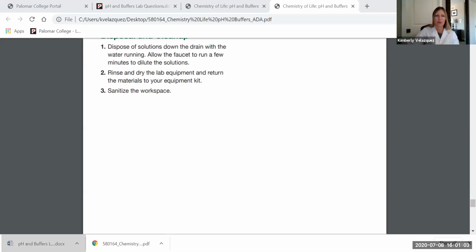Okay, activity 2, completing the data table, answering the question, and then inserting your picture. And finally, activity 3, you need a drinking straw for this activity. You're going to fill a beaker with water, add the pH indicator, note the color, and take a picture. Then you're going to take the straw and blow bubbles for 2 minutes. So you can take breaths, but keep blowing as many bubbles as possible. Add pH indicator again, and now note what the color is.